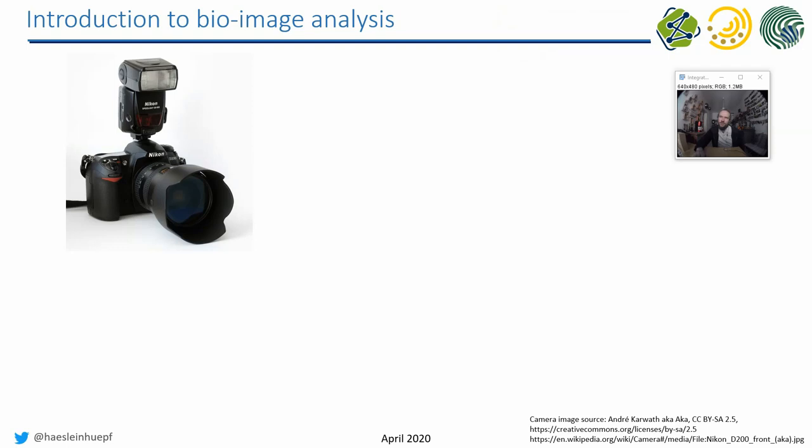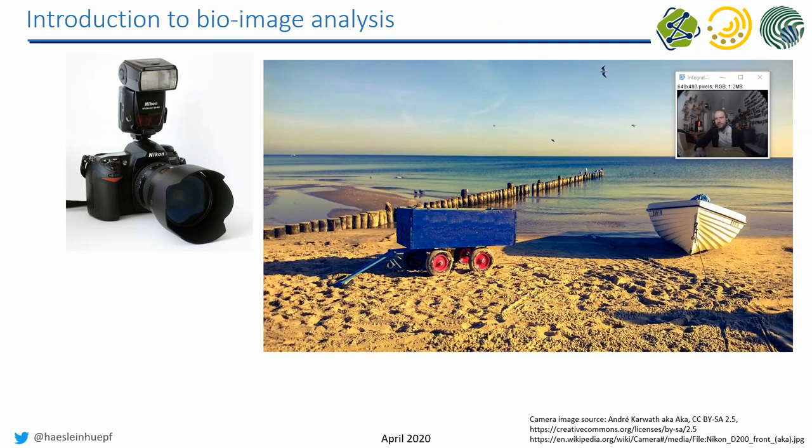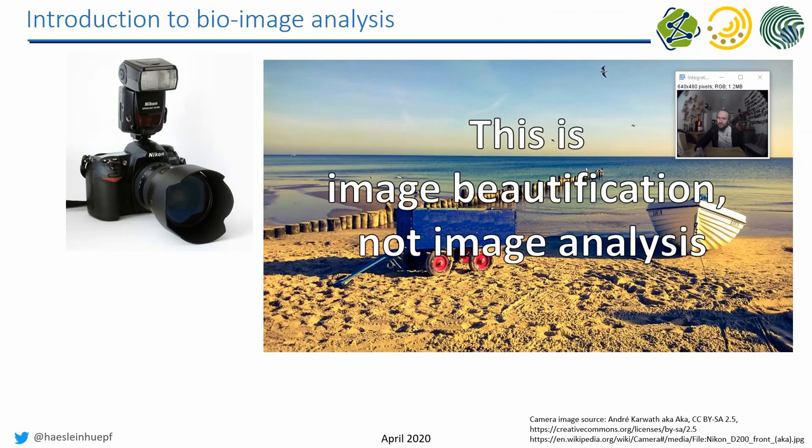If people think about image analysis, you often first of all think about a camera and you think about a scene. And then you can do certain things with images, like you can, for example, change a bit the contrast. You can also remove objects you are not so happy about. And the first take home message is, this is image beautification, not image analysis.